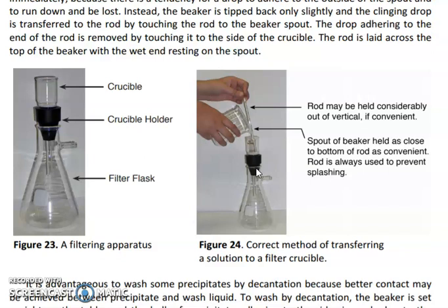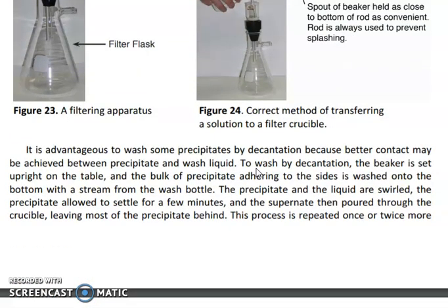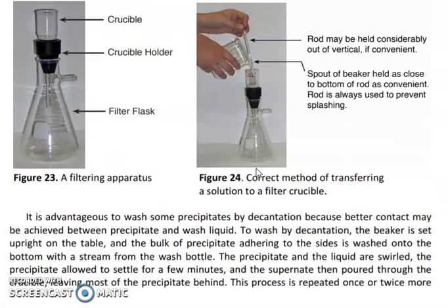You know friends, you have the precipitate. If one time it dissolves in any solvent, then again it will be problematic for you. So you have a 4 hour or 24 hour reaction, and if you do not work properly, then 24 hours or 8 hours of hard work will go in a drain. So friends, be careful when you are doing filtration.